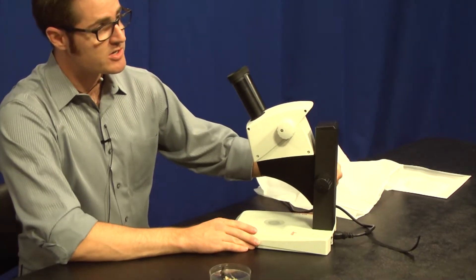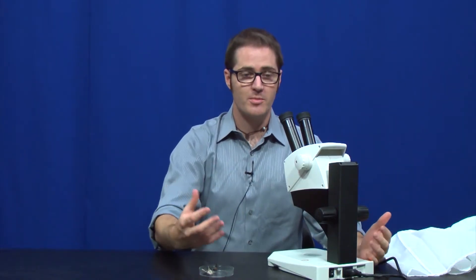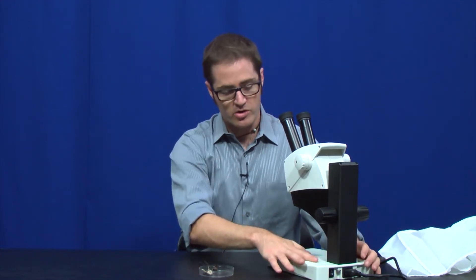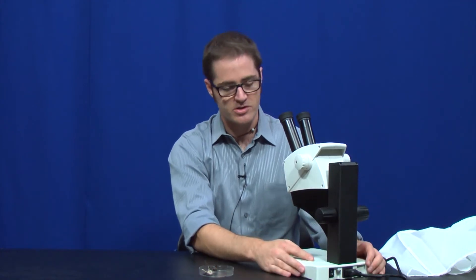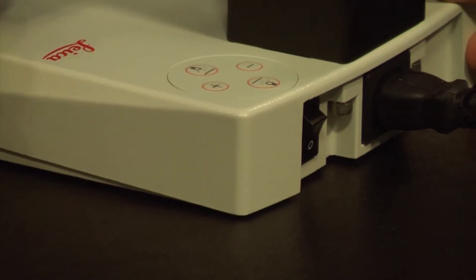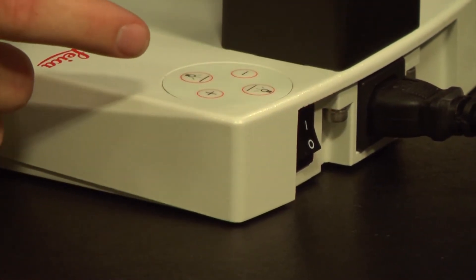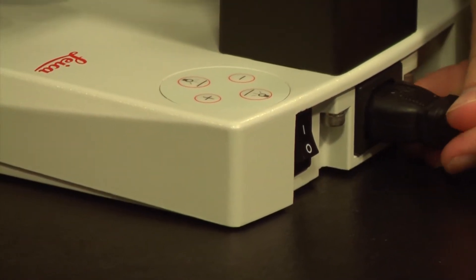We have a couple of different illumination techniques with this scope. We have what we call reflected illumination or light from the top down, and then we have transmitted light or light coming up from the bottom, depending on the sample you're using. The controls for the light are here on the back right-hand corner of the microscope. There is a power switch on the back of the microscope. We'll flip that up to bring power to the microscope.